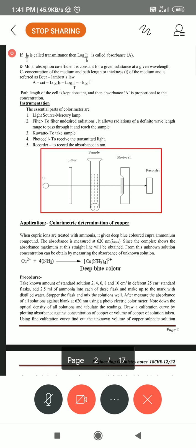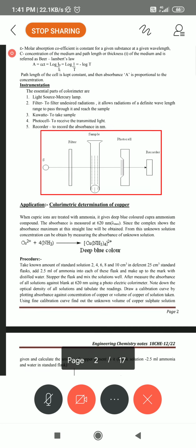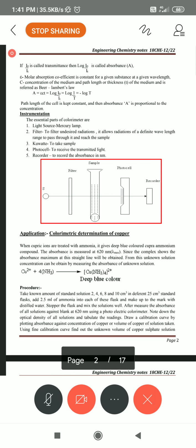So afterwards you prepare the iron sulphate, that is FeSO4·7H2O standard solution. Then you will go into estimate. As the same for zinc sulphate also, you prepare the unknown solution, don't throw it. Again you will prepare the standard solution of zinc sulphate, then you will go into estimate.